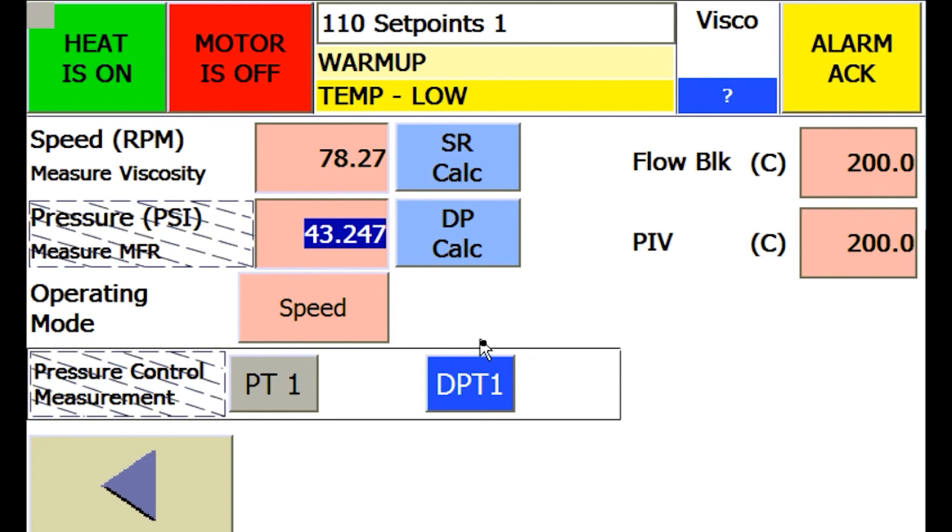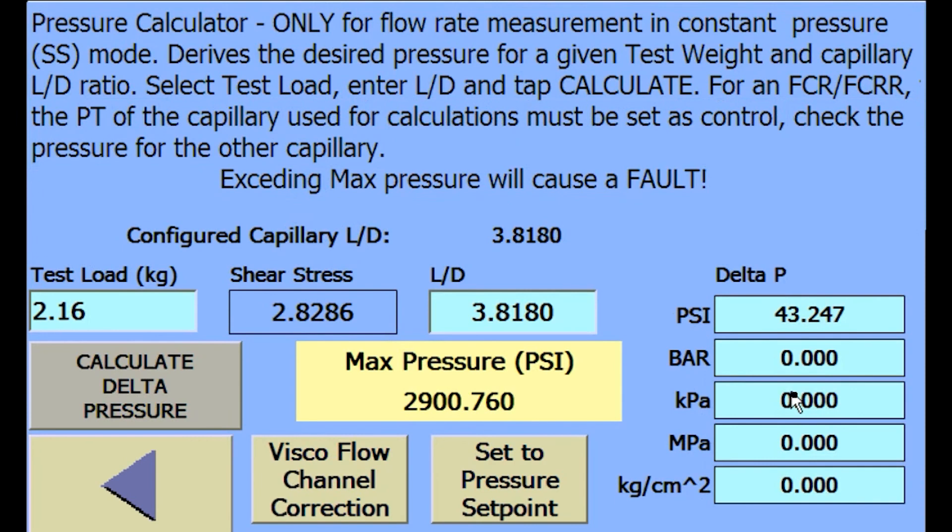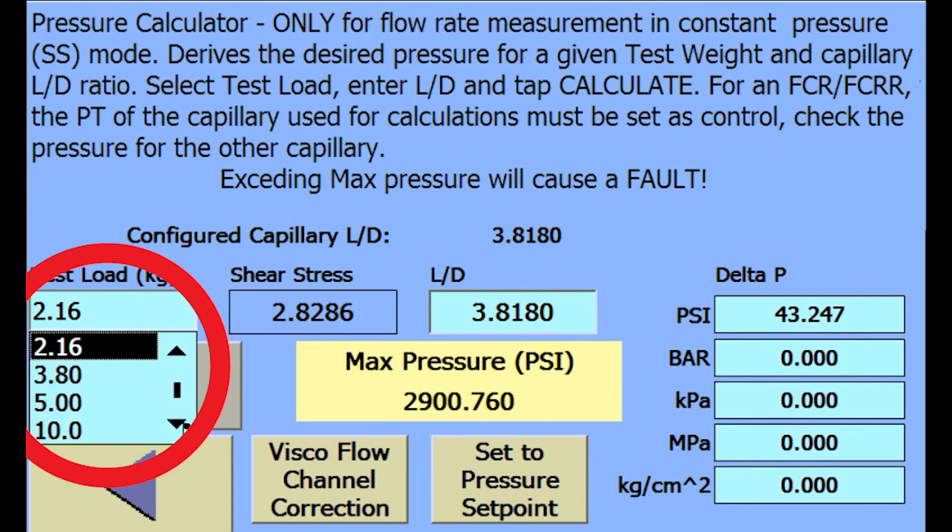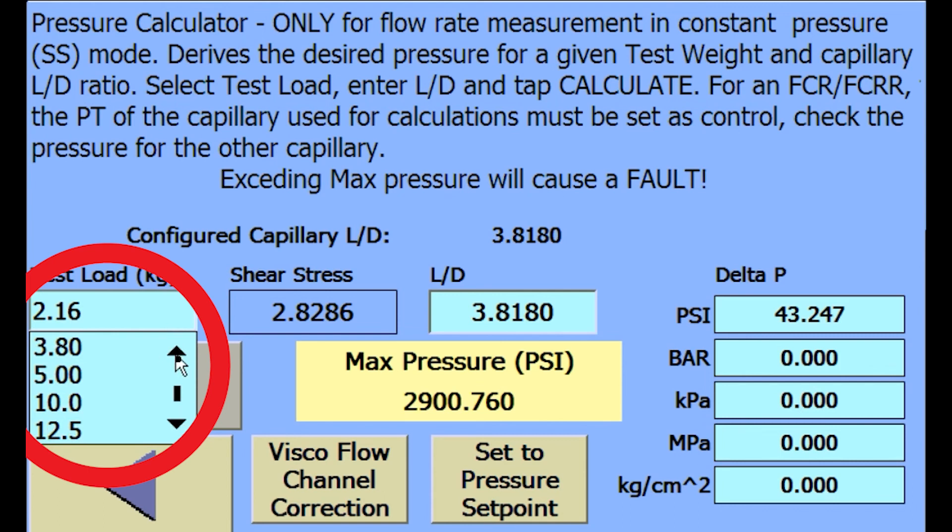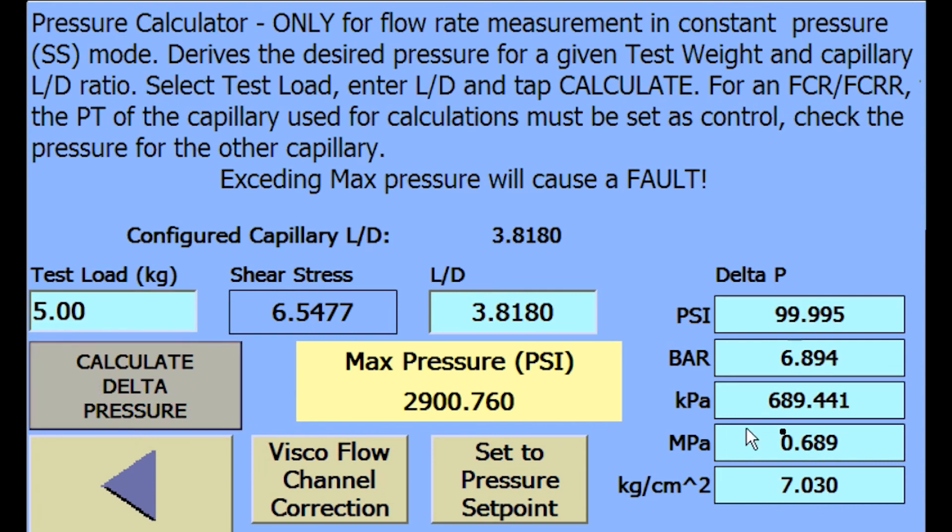For shear stress calculated set points, press the DP calc button. Shear stress set points are based on ASTM or ISO defined test weights in kilograms. Select the desired test weight from the list of ASTM or ISO test weights and simply press calculate delta pressure.